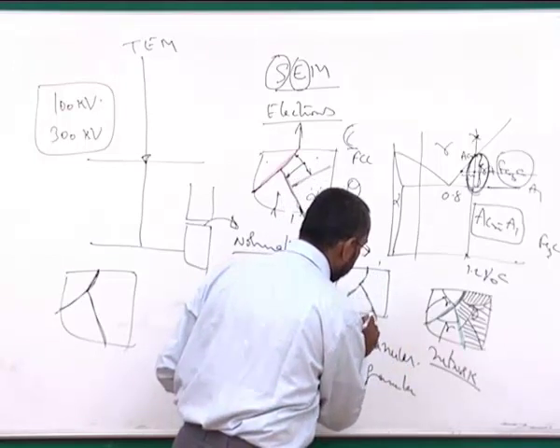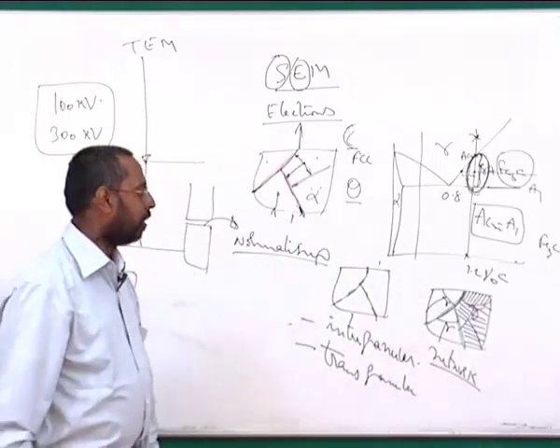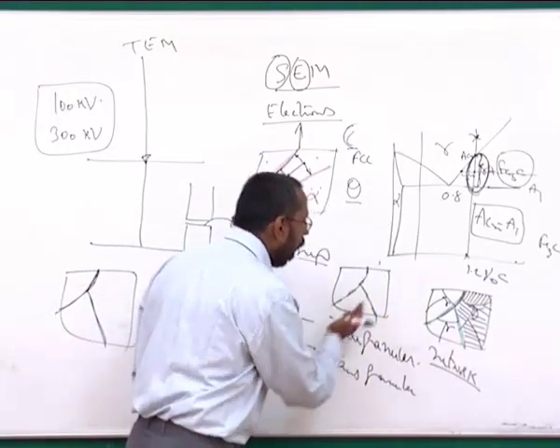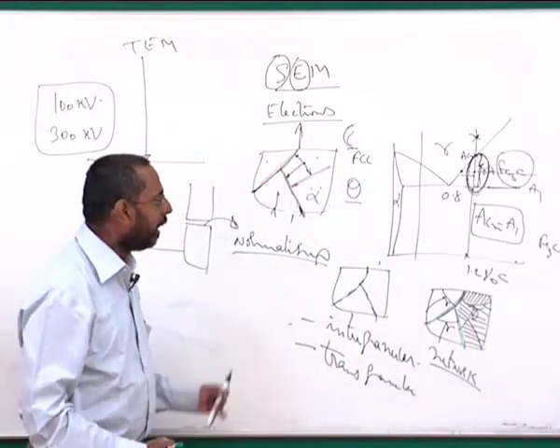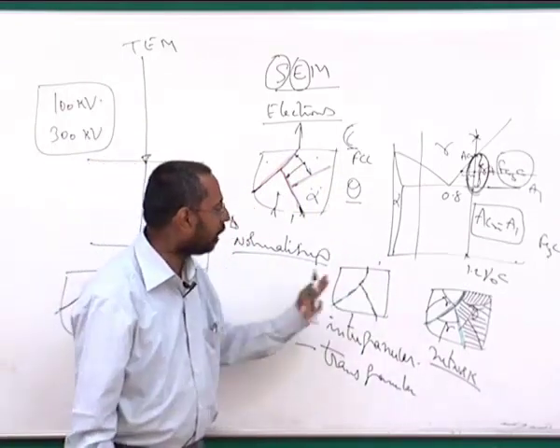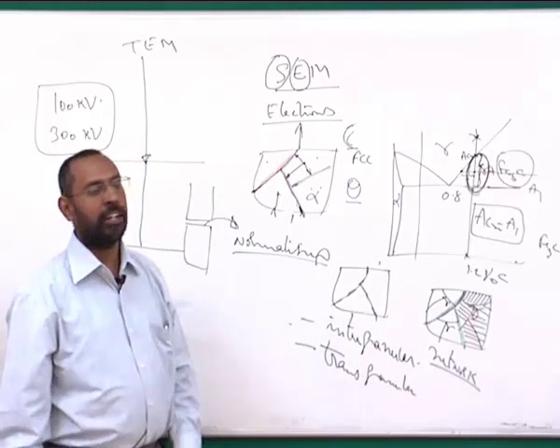particles at the grain boundaries. So it will nucleate at various places, but it will not have time to grow along the grain boundary continuously, and as a result you will see that the continuous network is now broken into what is called a discontinuous network.